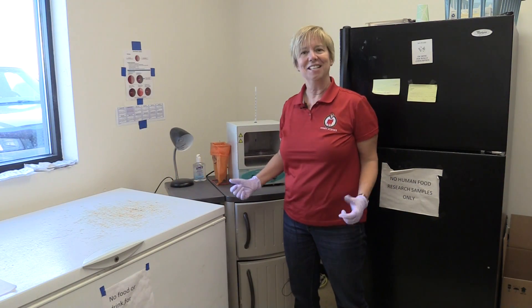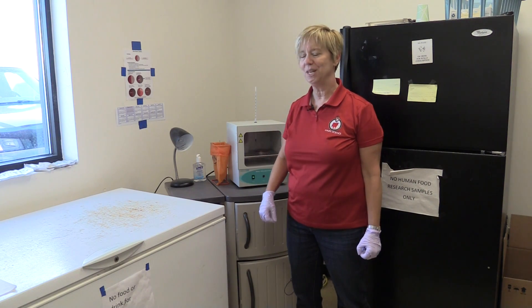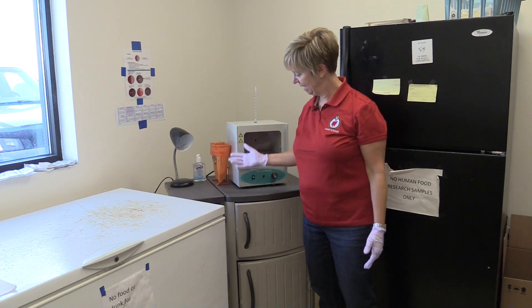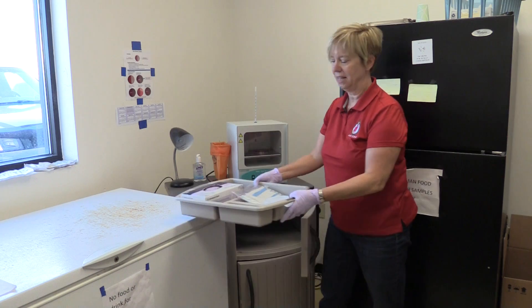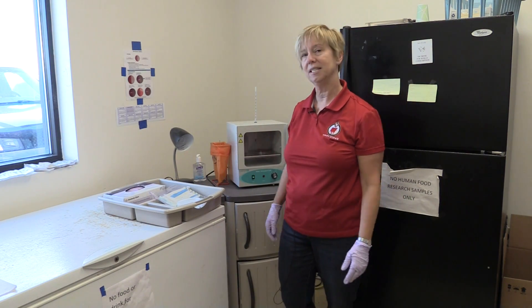You can see that we really don't need a lot of supplies to do these on-farm culture programs, and that's one reason many farms have been able to adopt the use of these programs. With this setup we've got everything stored right here in an easy tray that allows us to easily access the extra tools we need to set up the plates.